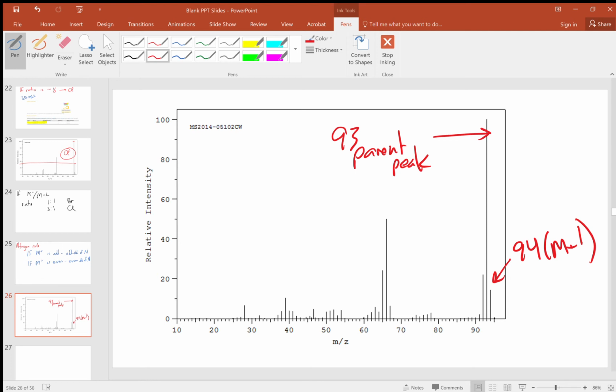Because there's a lot of functional groups that we can't really discern from mass spec. Ethers don't really show up very well. Alcohols we can certainly see, but they're going to be missing 18 most of the time, and so we've got to go to the IR to determine that. Carbonyls, a lot of carbonyls fragment very easily right next to where the carbonyl is.